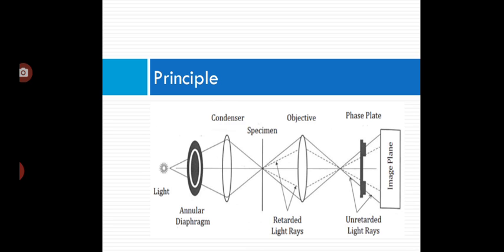The working principle of this phase contrast microscope includes partially coherent illumination produced by the tungsten halogen, which is directed through a collector lens and focused on a specialized annulus, that is, a condenser annulus, positioned in the substage condenser front focal plane. Wavefronts passing through the annulus illuminate the specimen and either pass through undeviated or are diffracted or retarded in phase by structures and phase gradients present in the specimen.